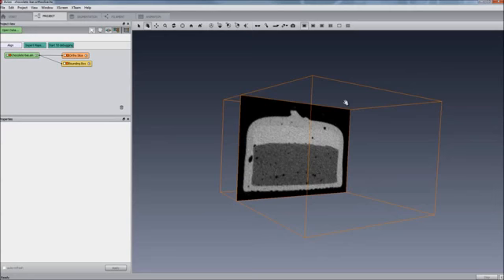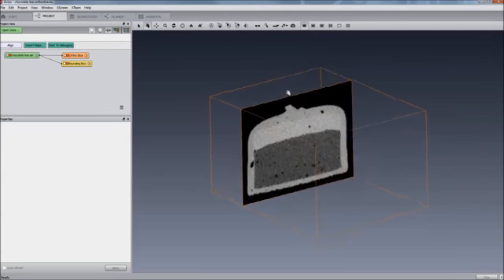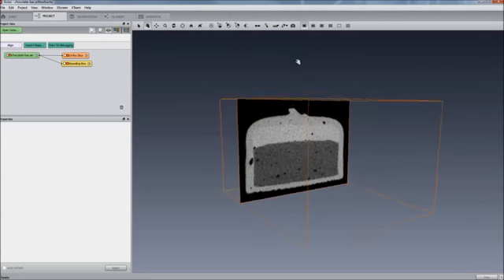By default, the visualization is set to use a perspective camera, which mimics how objects appear in the real world. Parallel lines in the scene converge in the distance, and far objects look smaller than close ones. Avizo provides a second mode, called orthographic, where parallel lines in the scene are always drawn parallel on the screen. The last button of this group is the camera mode button, which switches between the perspective mode, which is the default one, and the orthographic mode.